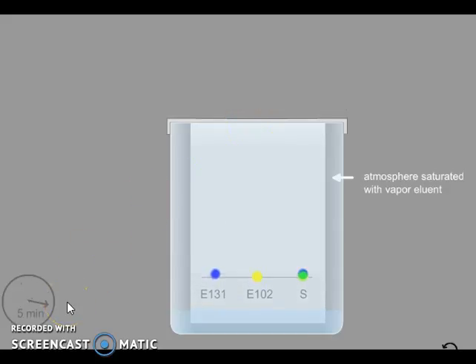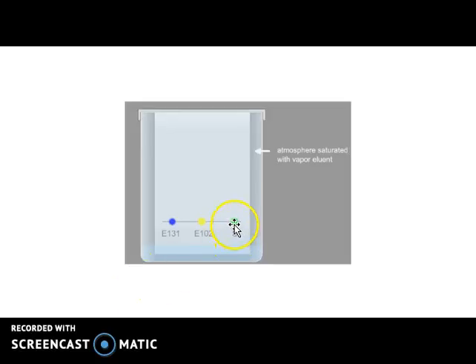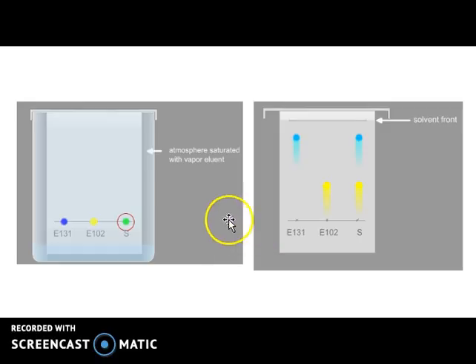You let some time pass while you wait for the chromatography to develop, and as you can see, spots start to move and also your sample starts to have two spots. So again, you first started with one unknown sample, and as you let the chromatography develop, you start to see your unknown sample has two spots. Now, what does this say about chromatography? What does chromatography do?